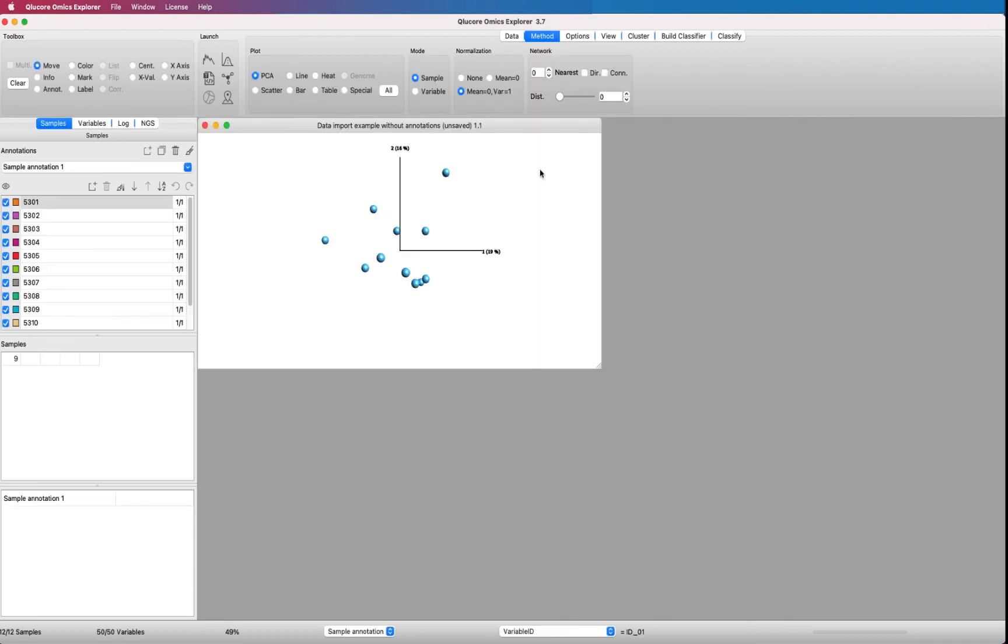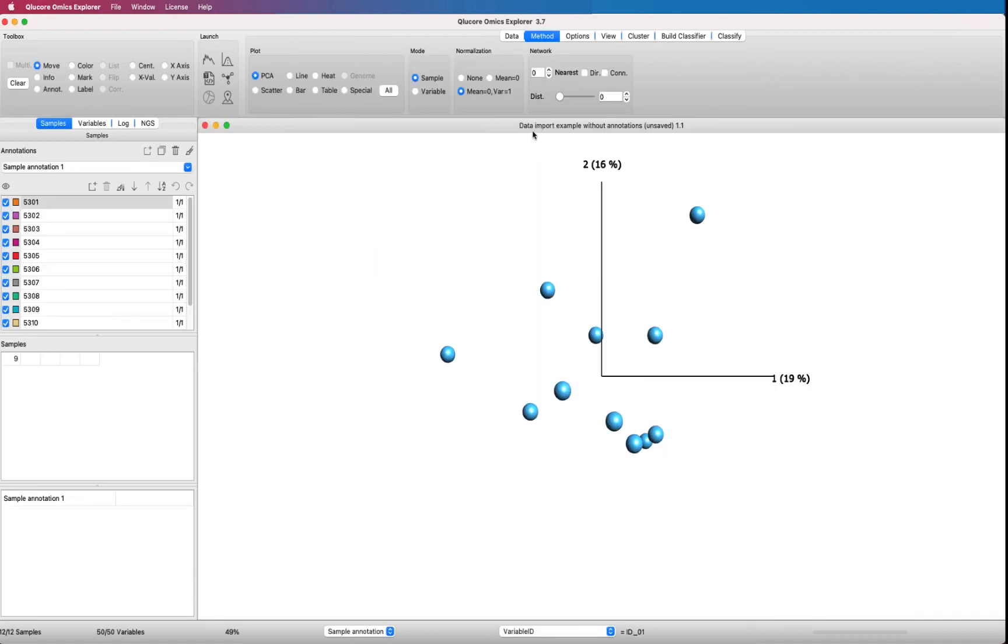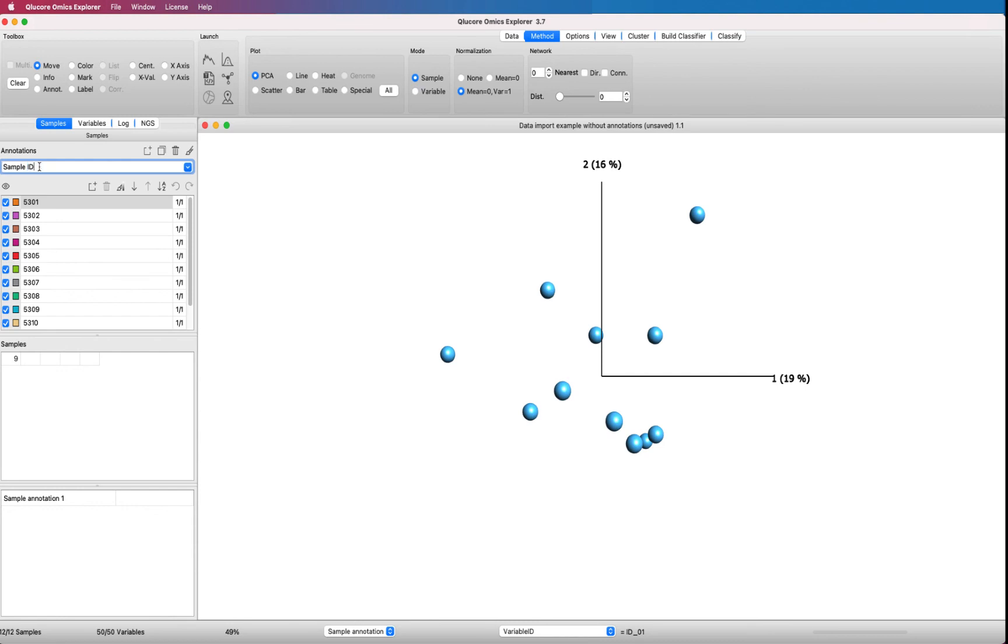The data set opens up with only one sample annotation called Sample Annotation 1. You can change this name. In this case, you need to add sample annotations in a separate step. Maybe you already have a separate annotation file, or you can create one.